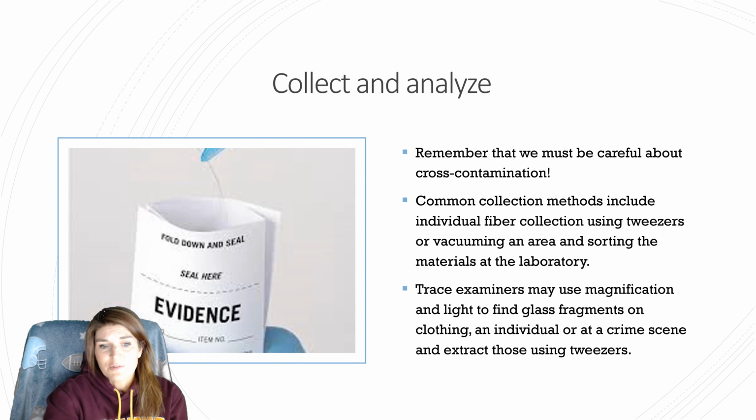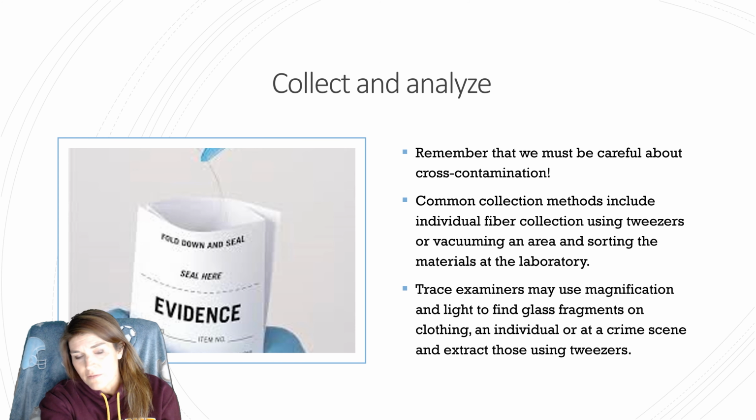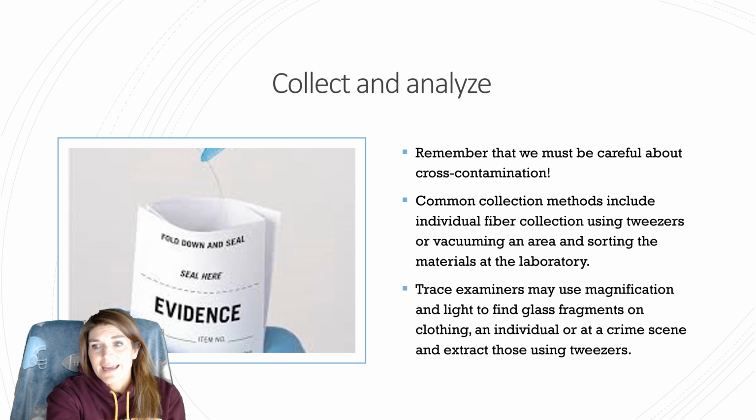When matching items, magnification obviously is a great tool because we can't always see how things go together, and fragments of things and little fibers aren't necessarily going to give us much information just from the naked eye. So we can fit things together, and also we can analyze.